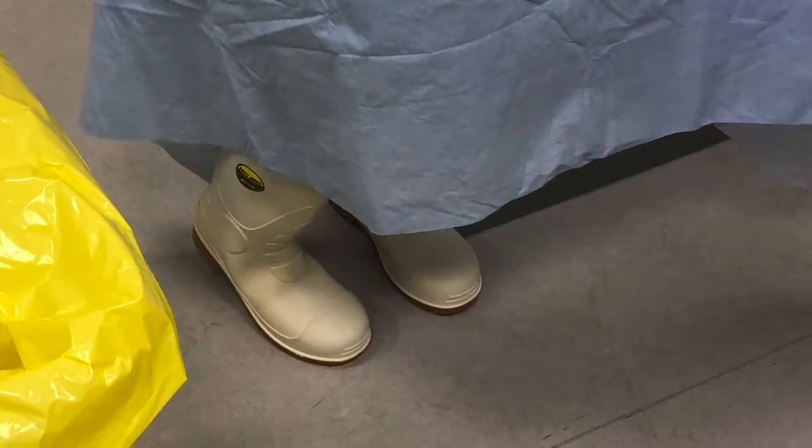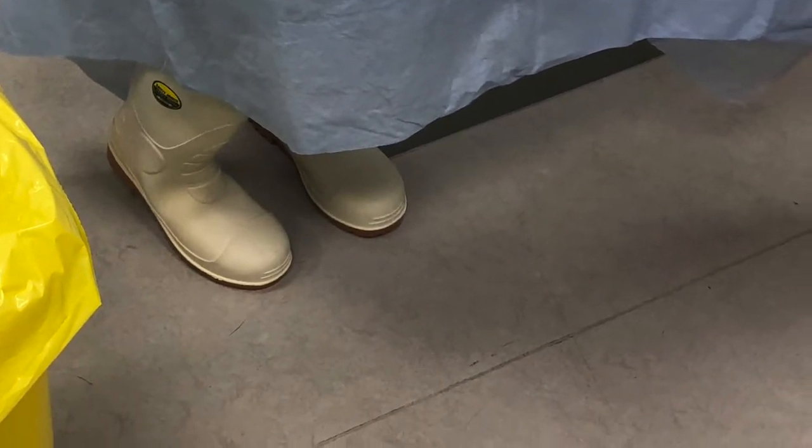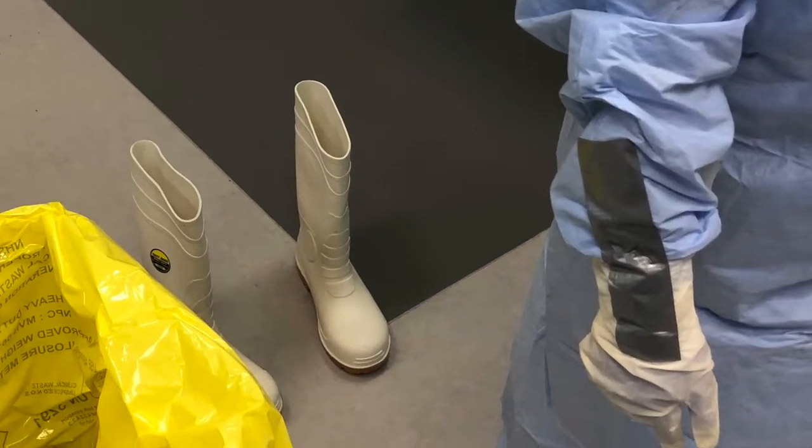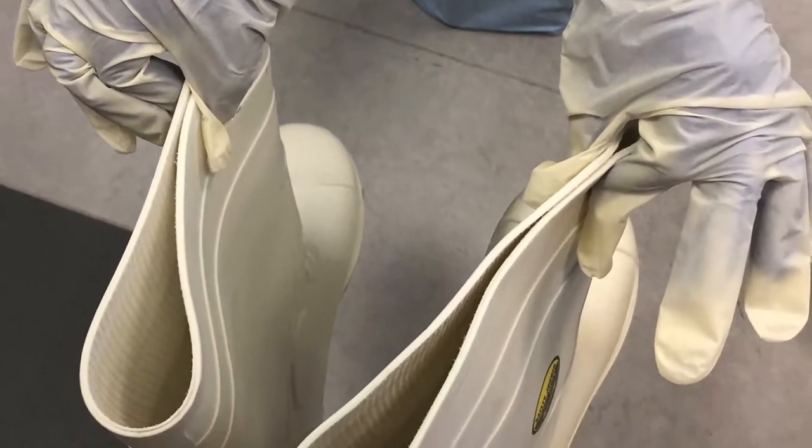Leaving the patient's room, step out of the boots into white clogs, stepping into the ante-room — Amber Zone. Lean back in and take the boots, pinching the top front of the boots, and place them into the disinfectant solution.